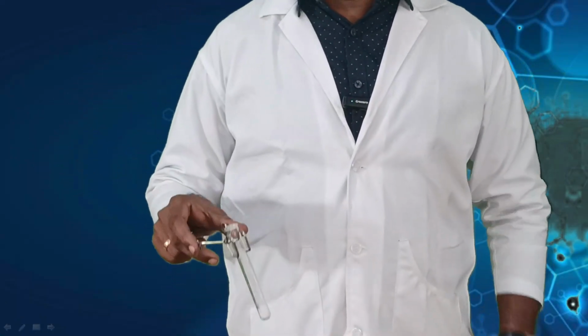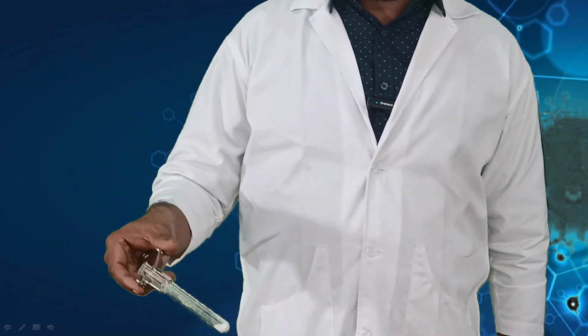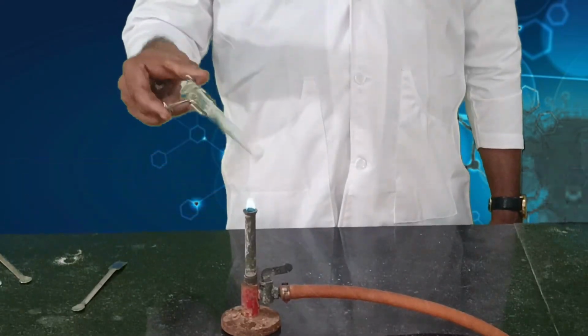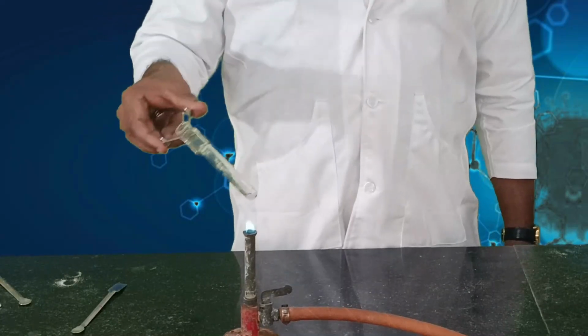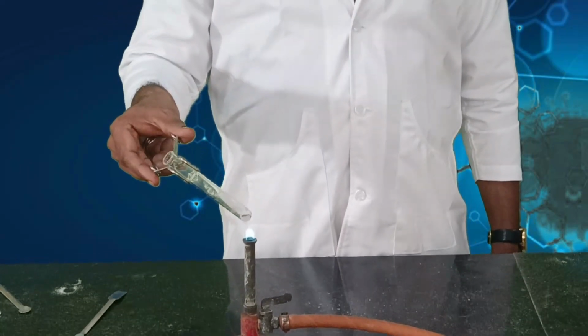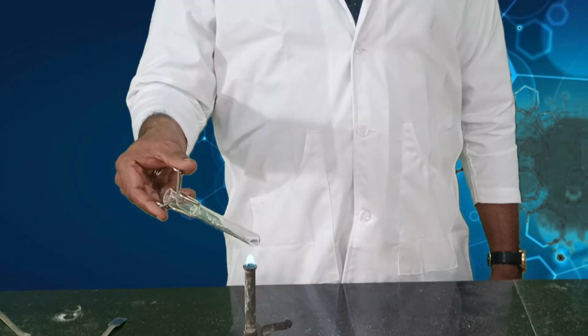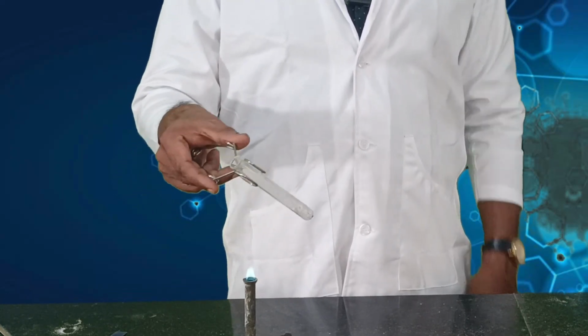For this test, you have to take a test tube that is really dry. In a dry test tube, take the substance and heat it strongly. It will become liquid first, and then ammonia gas will evolve from it. You have to strongly heat until all the ammonia gas is evolved.